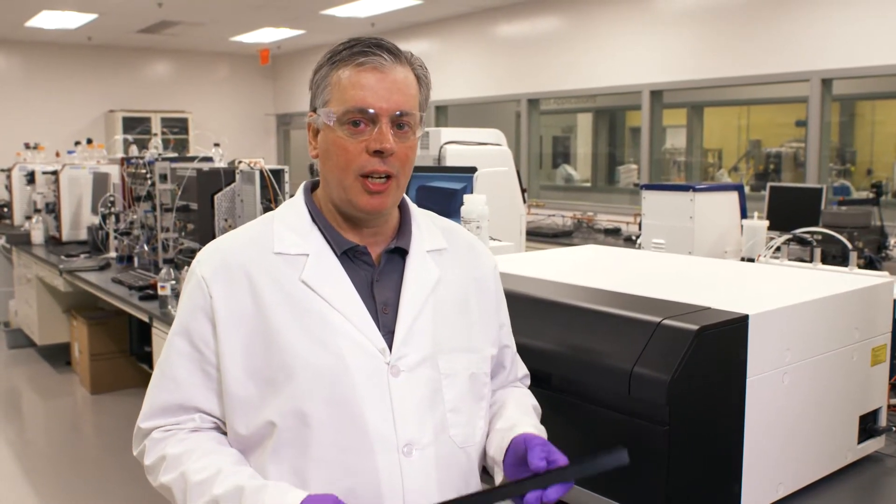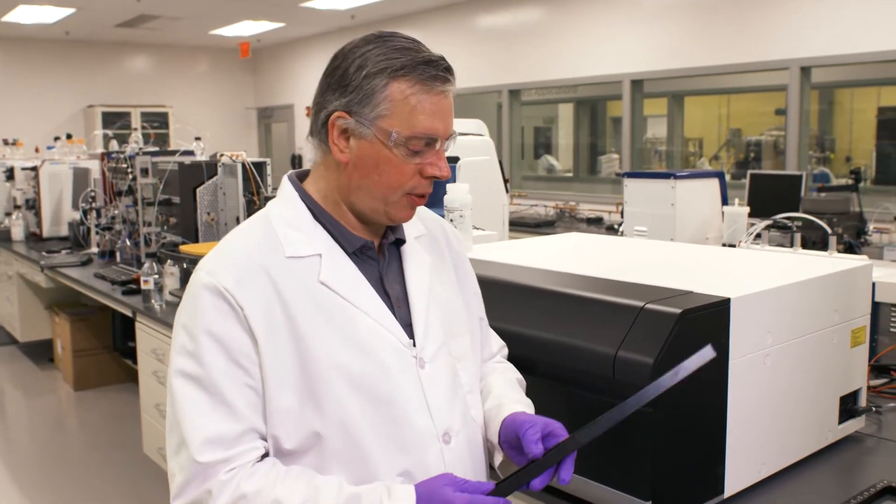In this session on the Amersham Typhoon, we're going to look at how to perform digitization and densitometry with the Amersham Typhoon system.